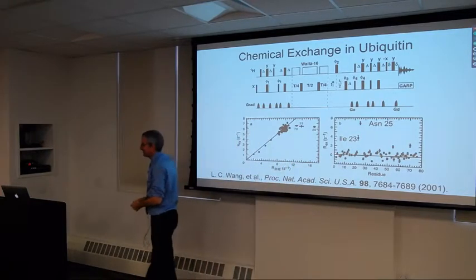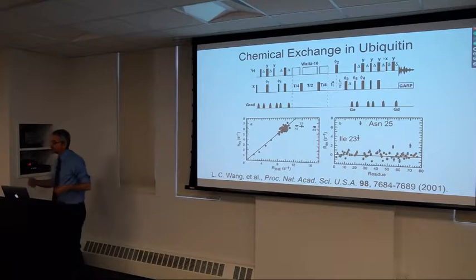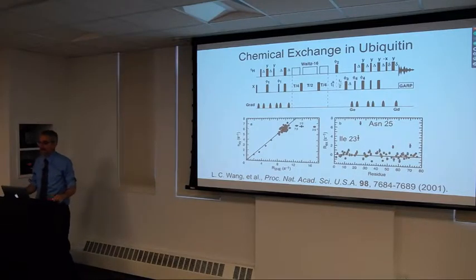So that means there's always efforts to develop better ways of detecting small amounts of chemical exchange broadening that wouldn't necessarily depend on a parameter that we don't know so well, like the chemical shift anisotropy.